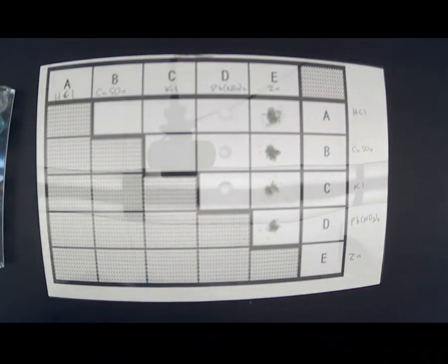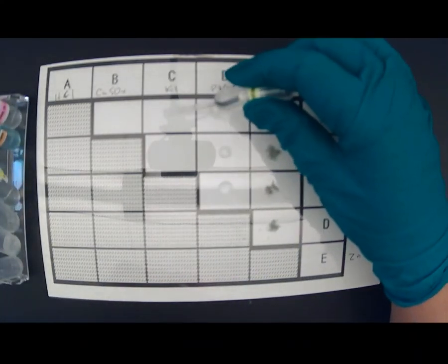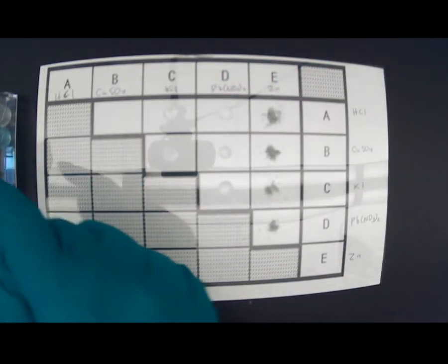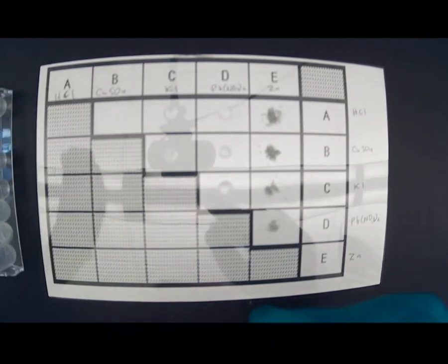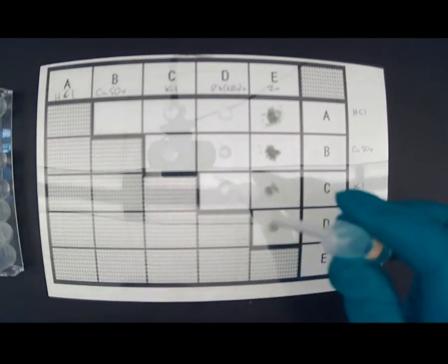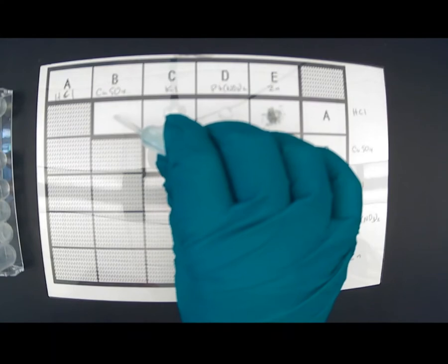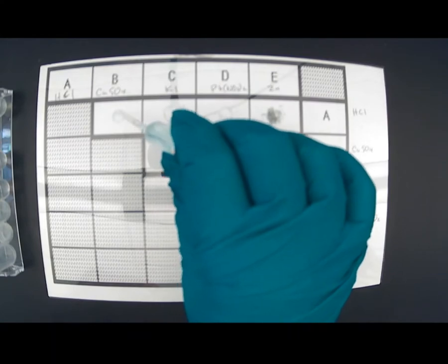Next one is potassium iodide — one, one, and one. And then next is copper sulfate, which is this kind of light blue color solution — I'm going to drop that in there.